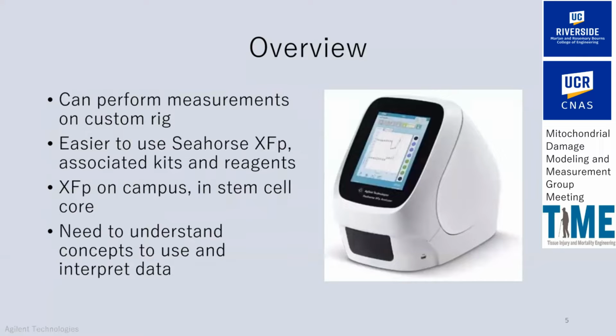It's possible to build your own rig to do this with an oxygen sensor and a pH meter, but it is easier and more efficient to use the Seahorse XFP or related instruments and the reagent kits that go with it. We have one of these on campus in the stem cell core.